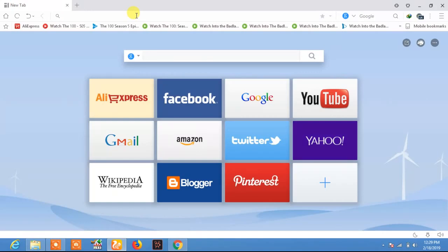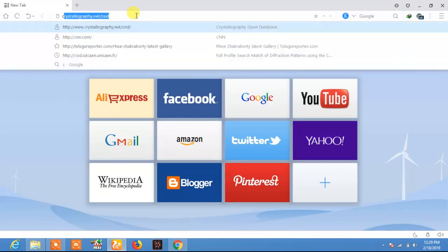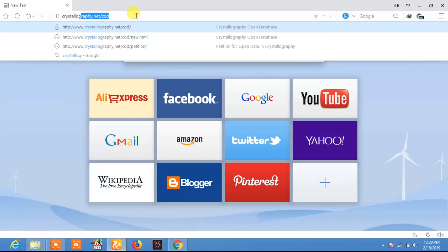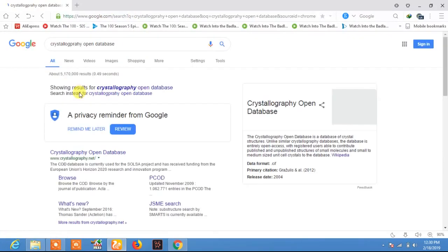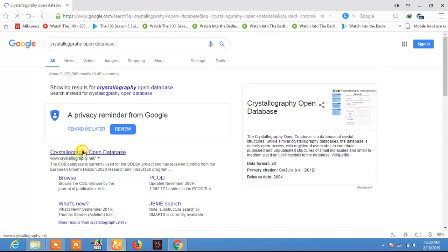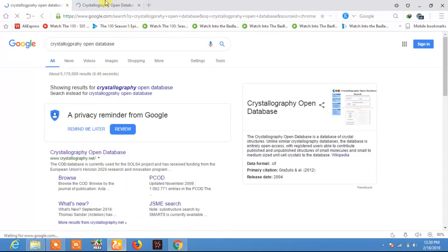I will be searching for the TiC CIF file on the Crystallography Open Database. This is an open source database which can be used by anyone freely without any cost for searching the crystallographic information or CIF file.